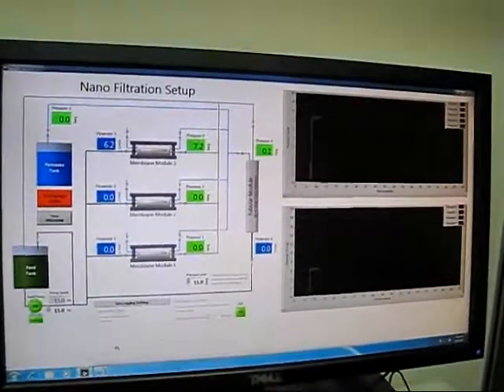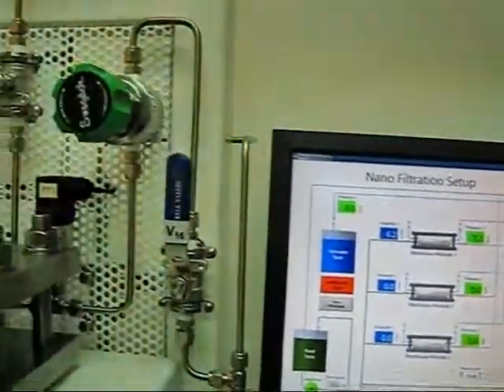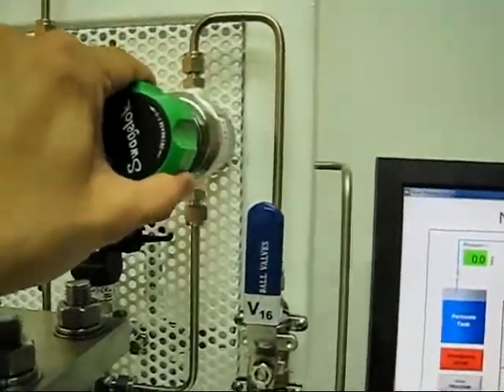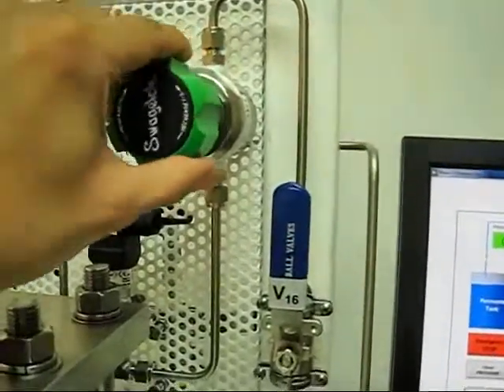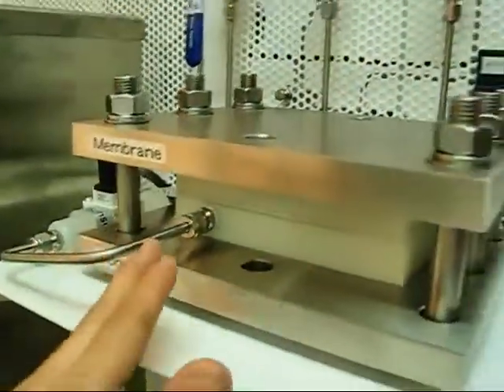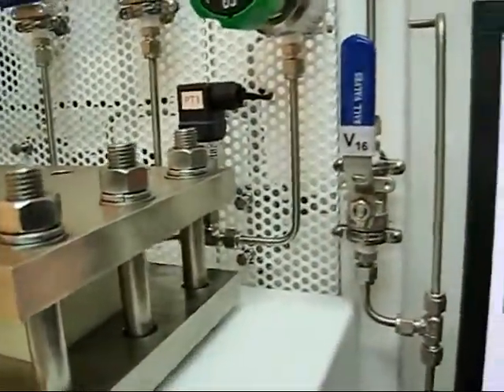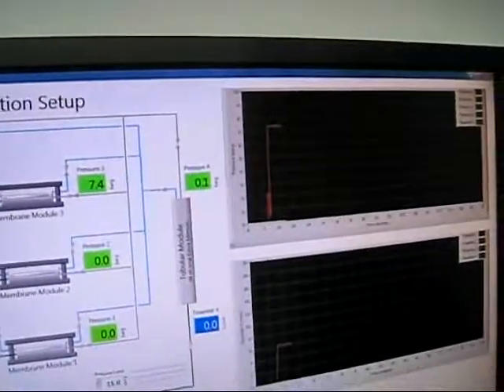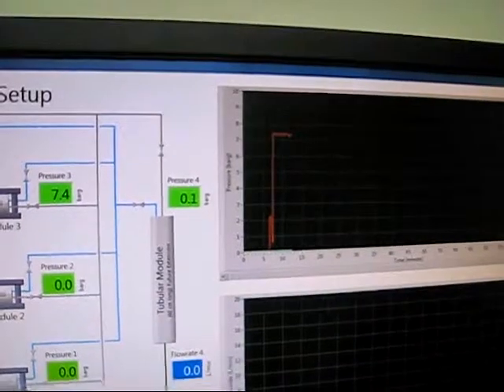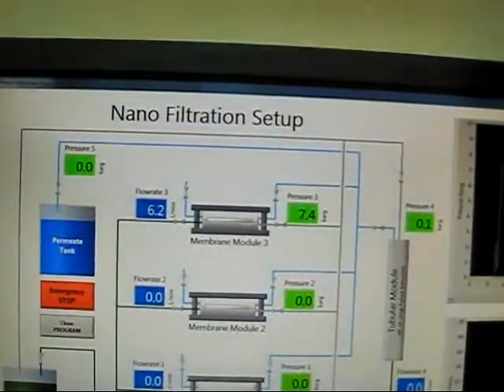As we wait for the steady state to arrive without any back pressure exerted on the membrane itself, this valve is fully open by making sure it is fully counterclockwise, and this is fully open. The fluid flow is through the membrane, out, and then goes back to the tank. The pressure has now reached a very steady value of 7.4, and the flow rate across the membrane is 6.2.